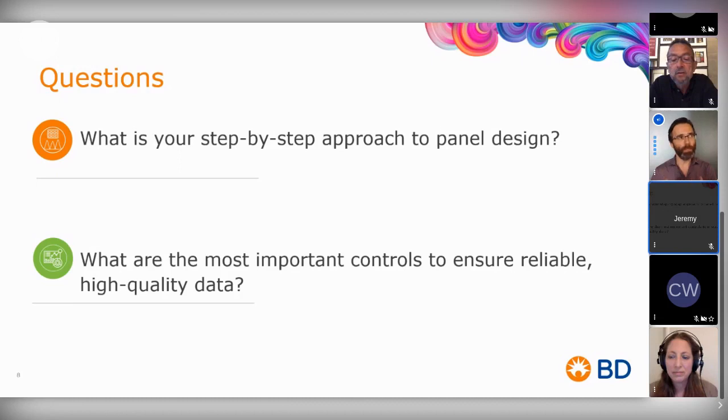And again, I mention this because I see a lot of researchers getting frustrated with, okay, I have a panel, it should work, right? I should just run it and everything is going to work fine. But it's not. It takes a big amount of time to validate all of these fluorochromes. And then there are a lot of steps where we need to change the panel, and it's just an iterative process until we find the right panel. So I think that's an important aspect that you mentioned, Yolanda, that people should understand that they have to go through all this process, and it takes time.